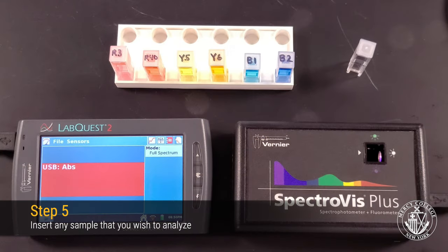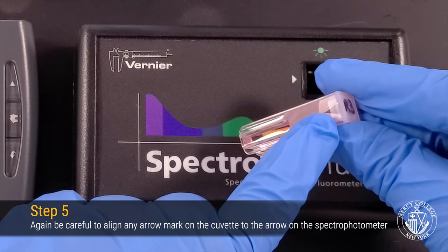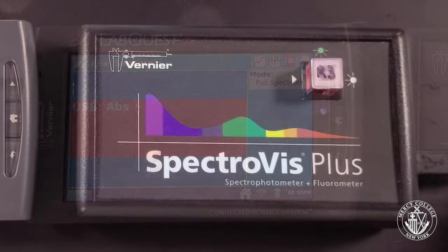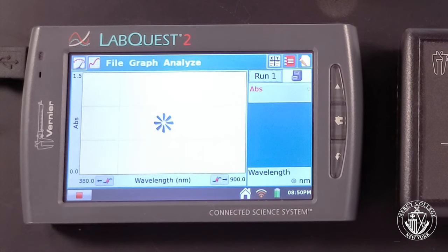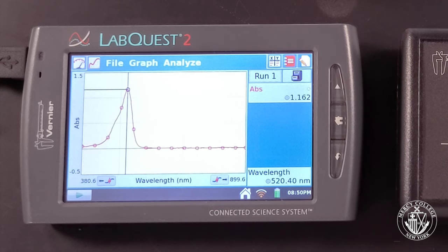Select a dye standard to analyze and carefully insert it into your spectrophotometer, again making sure the arrow on the cuvette aligns with the arrow on the spectrophotometer. Use the Play button in the lower left-hand corner to record your absorption spectrum. Once you've captured a stable recording, use the Stop button to end the data collection.